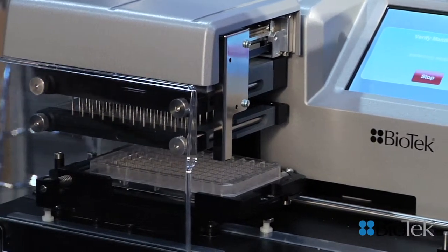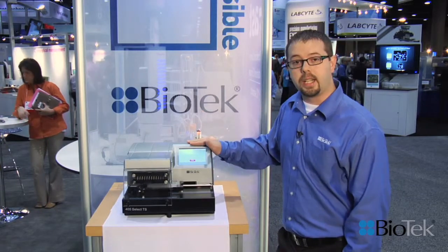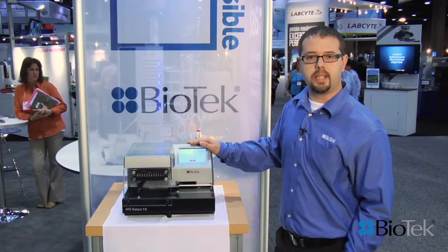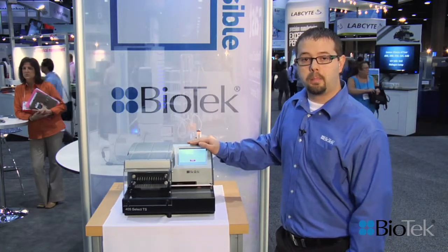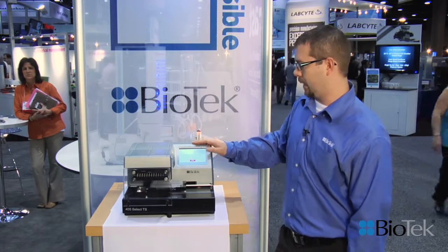These models start around twelve thousand five hundred dollars. They can be integrated with many commercially available partners out there including Hamilton, Tecan, and Agilent, to name a few, and these are compatible with our Biostack microplate stackers for ANSI and SBS standard height plates.